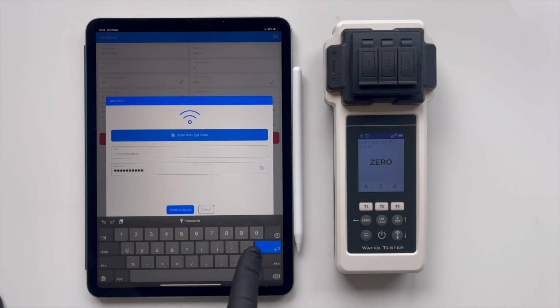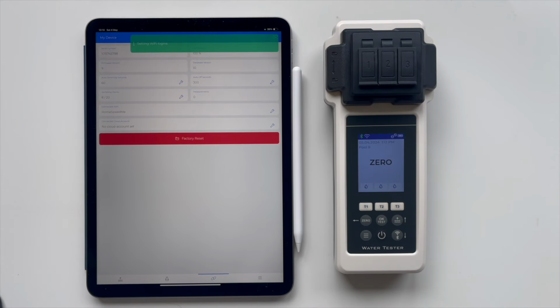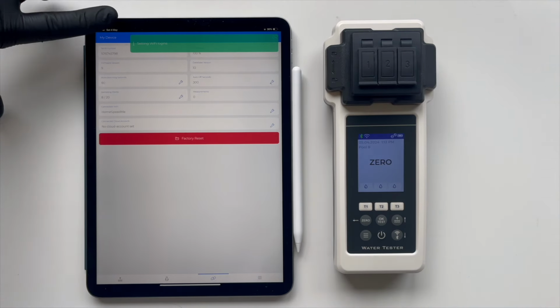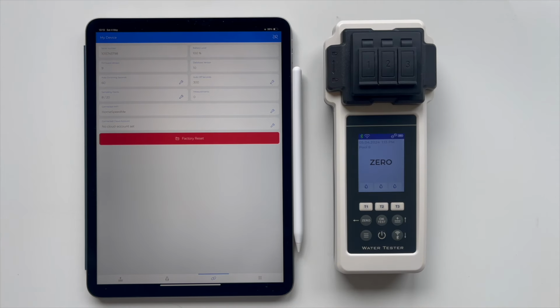After you've input the password, you need to send the entered data to the device. We wait again until the green banner disappears, indicating that the data has been successfully sent to the tester. How can you check if the tester is correctly connected to Wi-Fi? Press the Bluetooth button once.